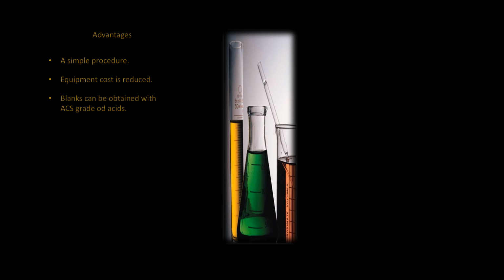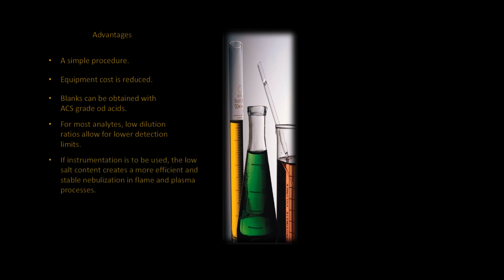More on blanks in an upcoming presentation within the series. The low dilution ratios, that is, between the sample and the acidic solution, allow for a lower detection limit in regards to elemental concentration. Solutions are used in instrumentation analysis. Instrumentation uses a process that requires the solution to be subjected to flame nebulization and/or plasma excitation. Salt content is very low in an acid solution. Salts will interfere with the analysis. The low salt content allows for a more stable nebulization in flame and plasma processes as it reduces the likelihood of the salts plugging up the nebulizers.